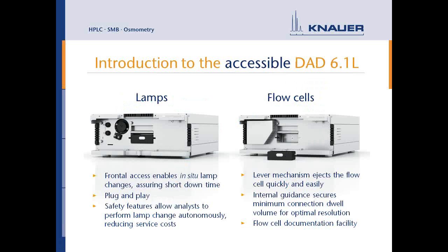On the right-hand side, we can see how the device looks when we have ejected the flow cell. In this case, all of the pictures are with the test cell. Obviously, we'll show a little bit later how this looks like in a real system.